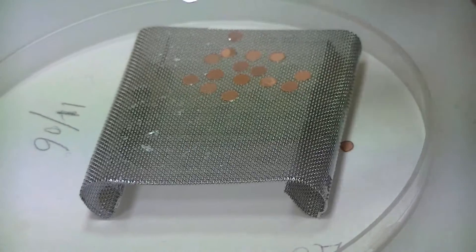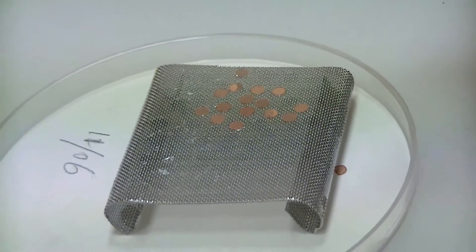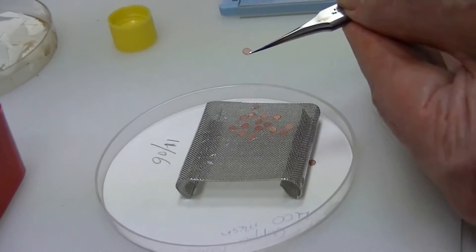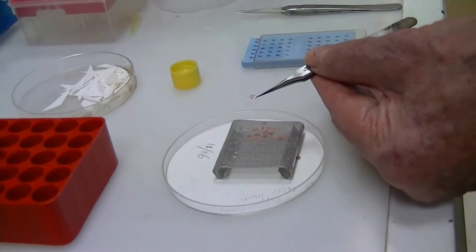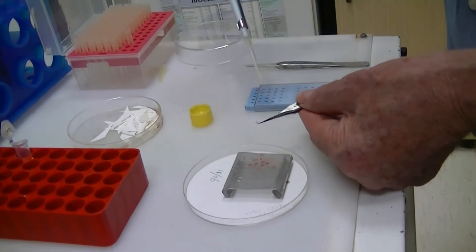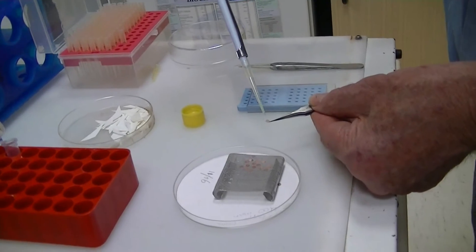So we pick it up from here and then we can apply the specimen directly to it using a normal micropipette tip. We apply the drop directly onto the grid like so.